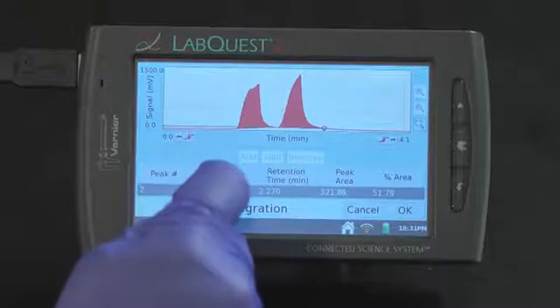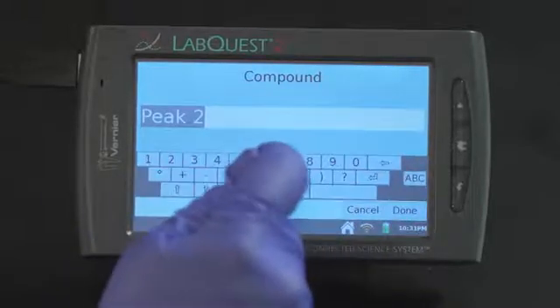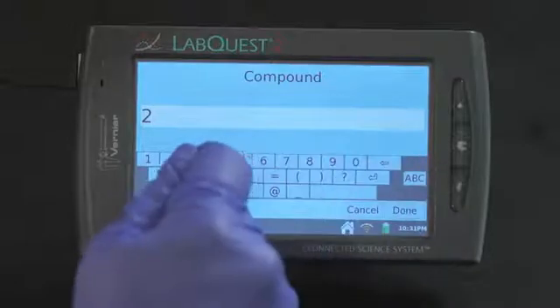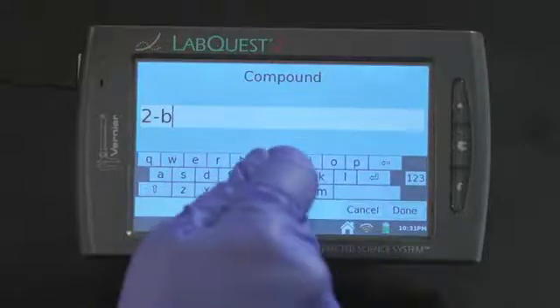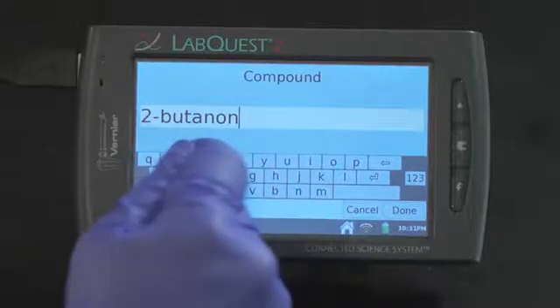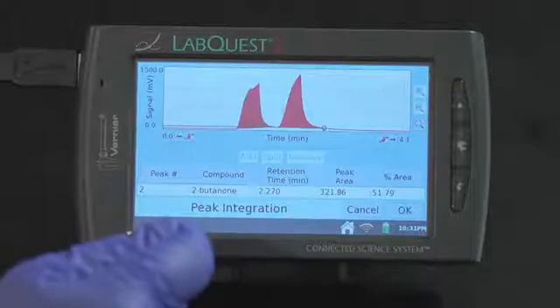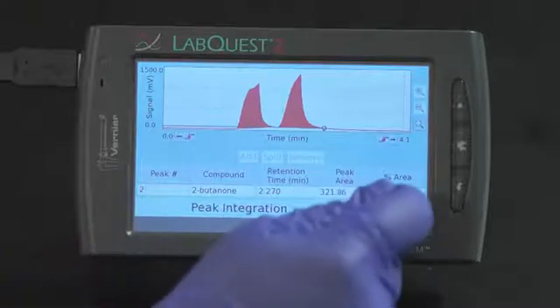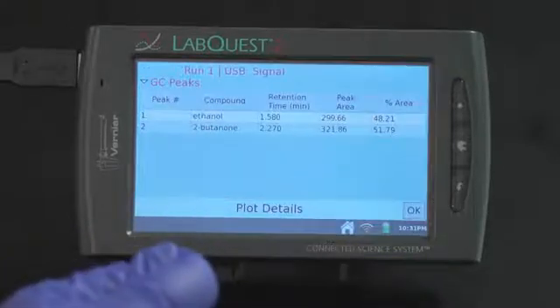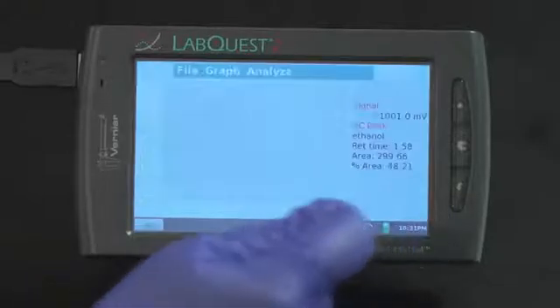For the second peak, type in 2-butanone. When you're complete, press OK. This will bring up the plot details. Then select OK to return to your graph.